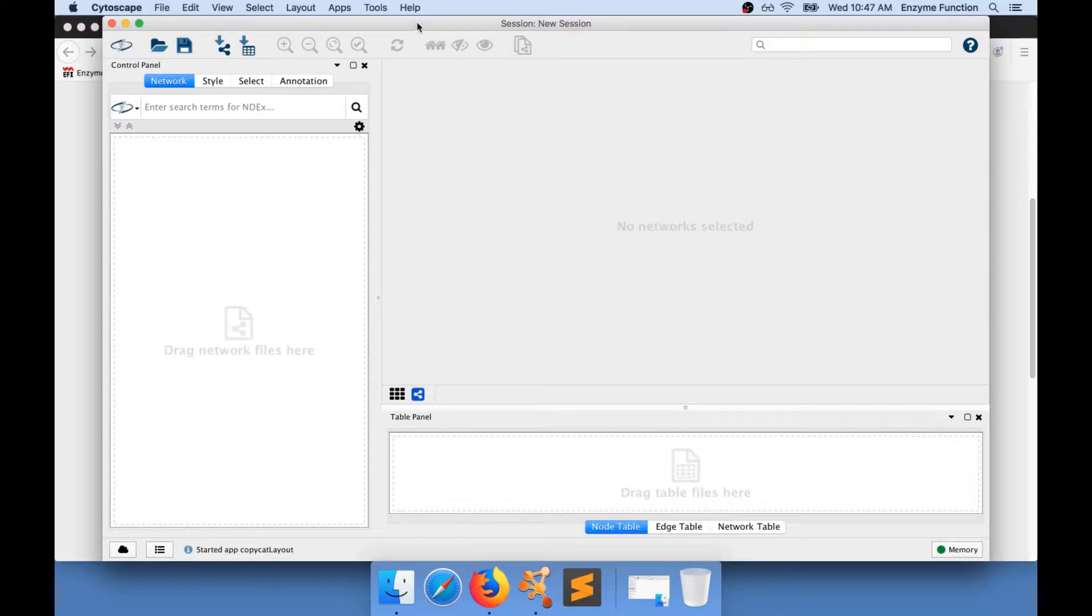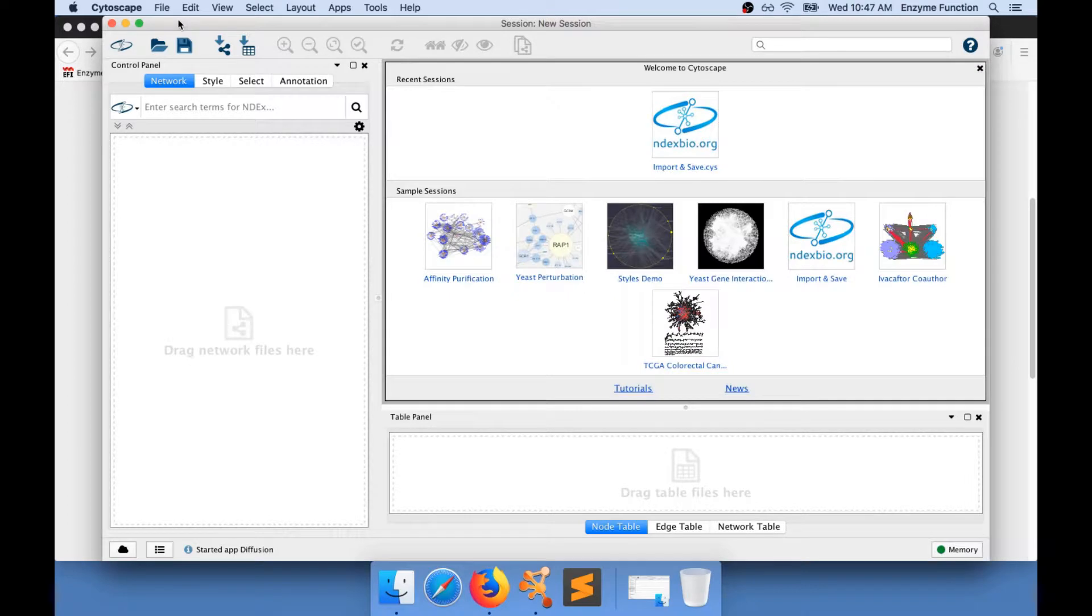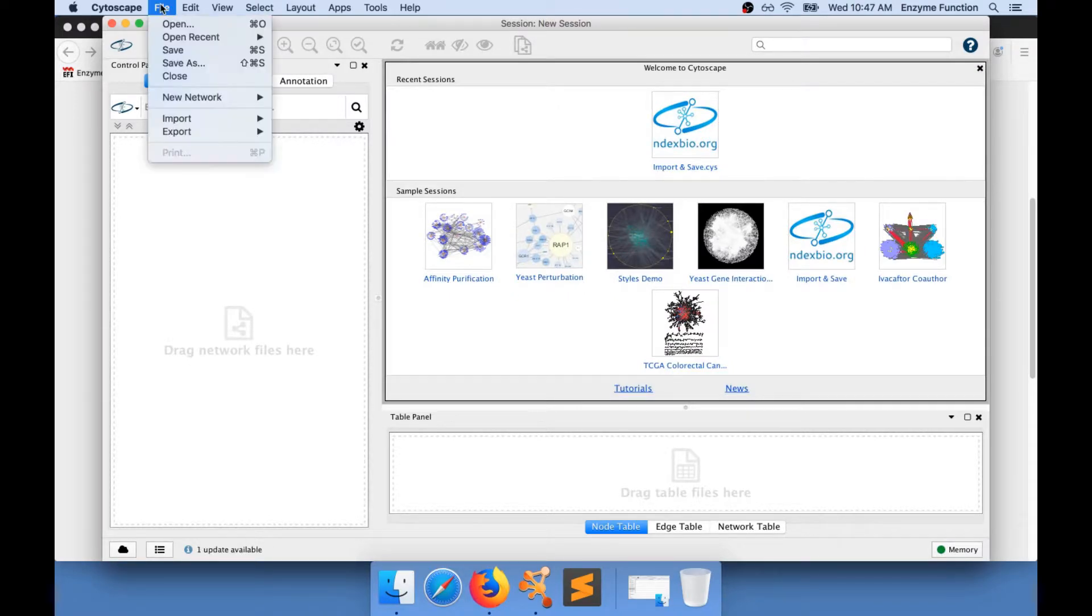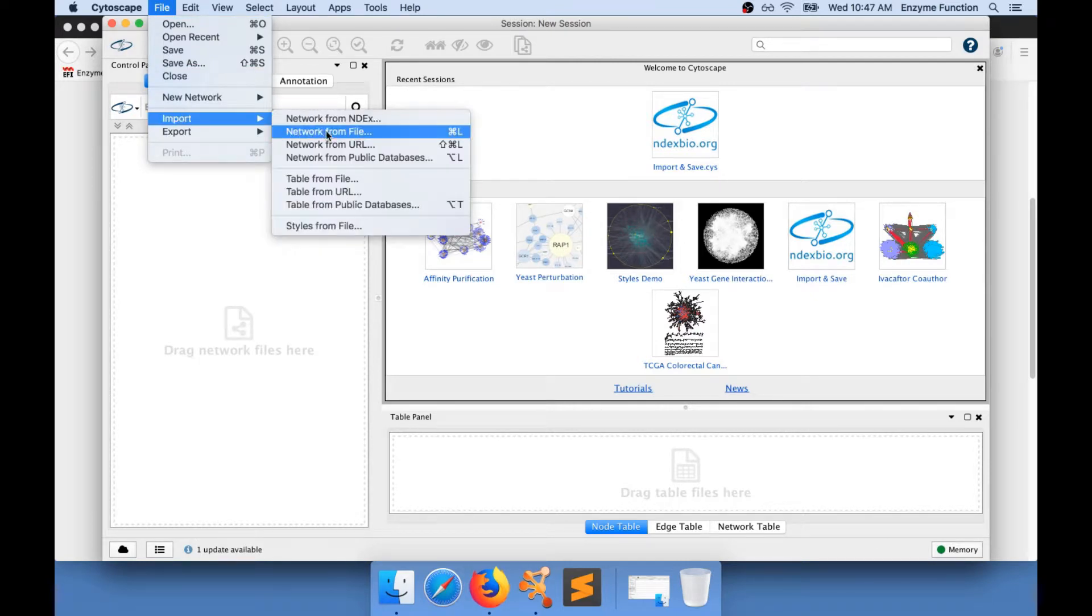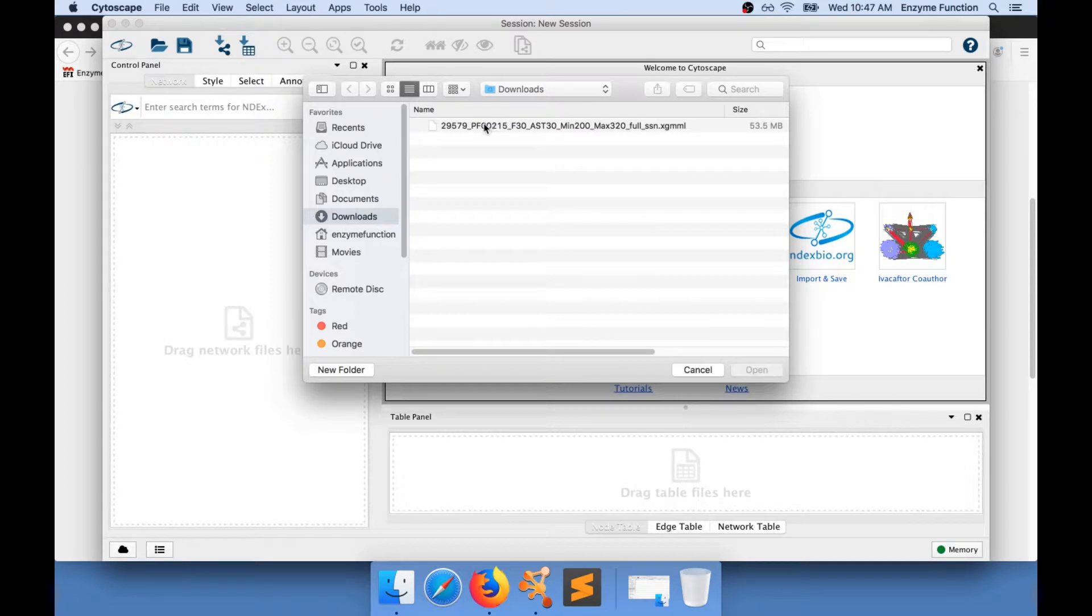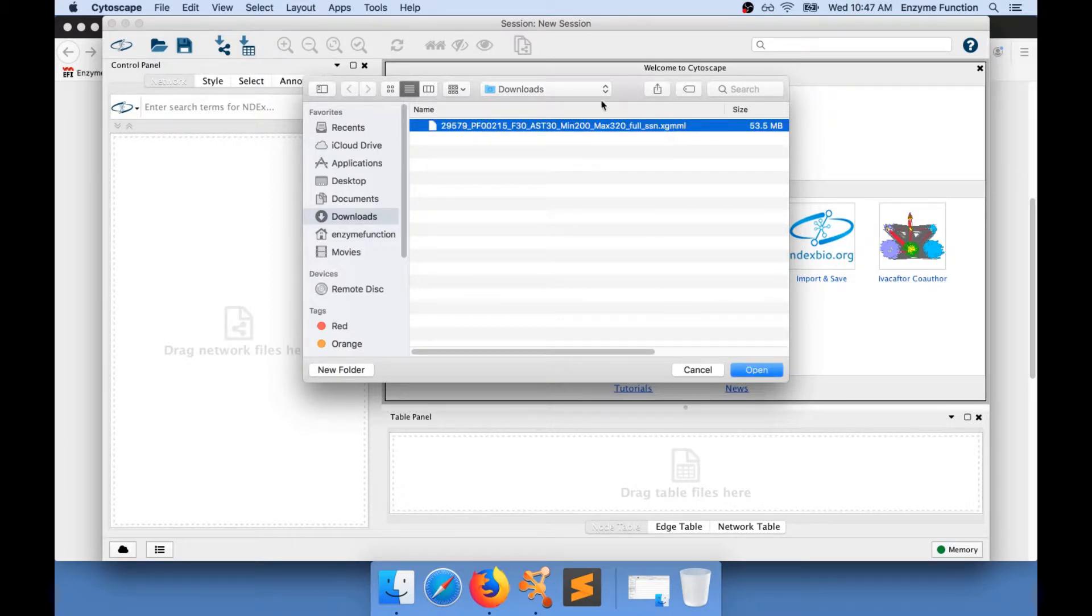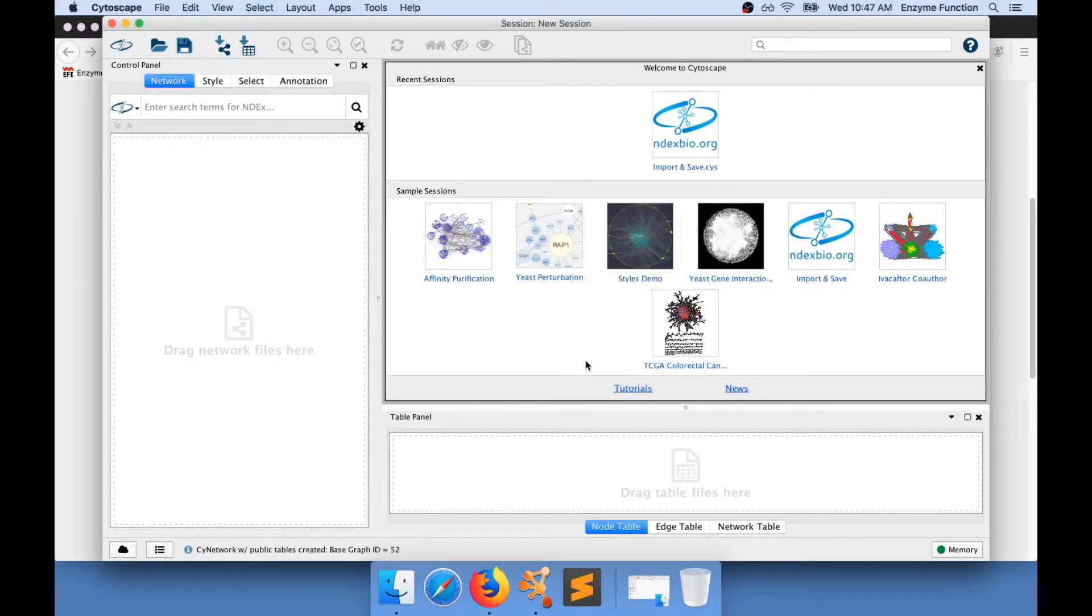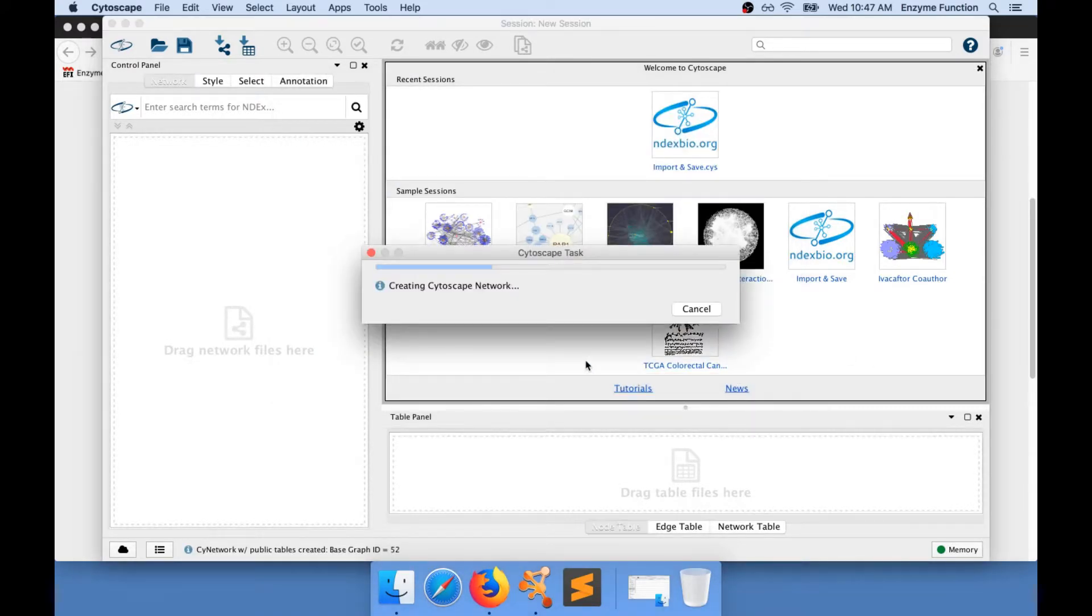Once Cytoscape is loaded, you will need to import a network into Cytoscape. To do so, go to File, Import, Network from File. I am selecting the network that I have just downloaded from the EFI website and I'm going to open this network file.